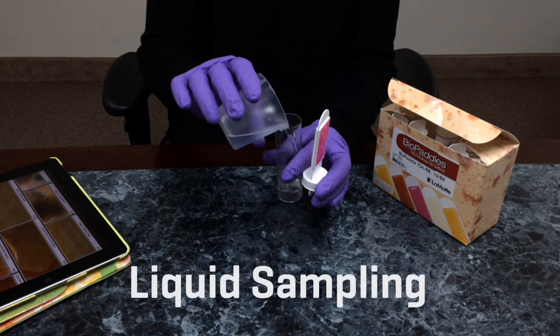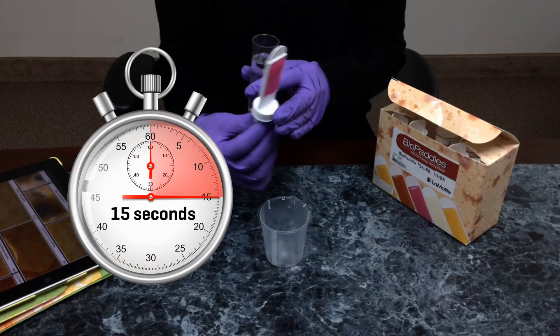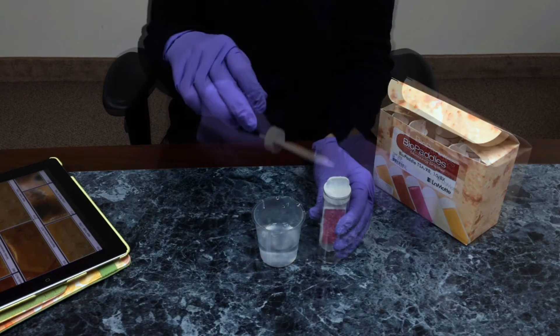For liquid sampling, fill the vial with the liquid to be sampled. Allow a contact time of 15 seconds. Empty the vial and replace the paddle in the vial. Incubate following directions.